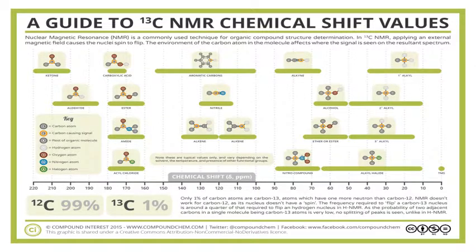So here we have just another guide from Compound Chem, and you notice this little tidbit of information down here in the lower left that shows you that carbon-13s are very rare compared to carbon-12s, and that's what makes them so useful for carbon-13 NMR. Also, carbon-12s do not have a spin state unlike the 13s, and so these two together means that the signals are unlikely to interfere with each other, and so we get a very nice clean reading. And then similar to the proton NMR, you'll see a lot of different groups have very wide ranges and then some have very narrow ranges. The only difference is the value for their chemical shifts as well as how far some of the shifts are.